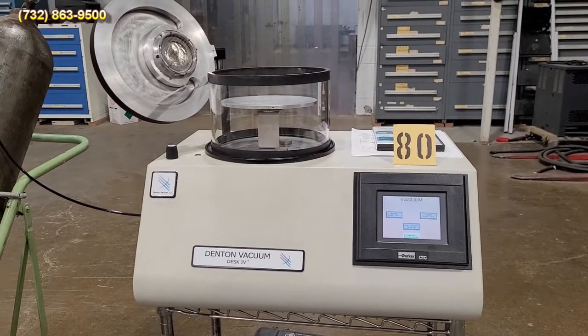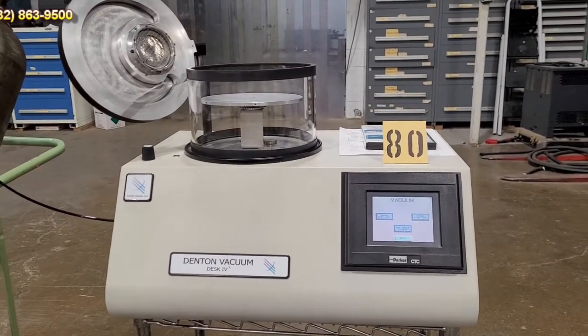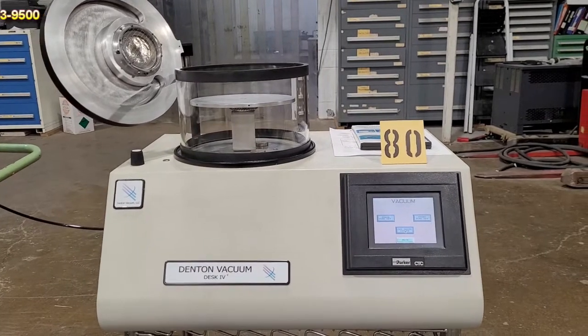The gas cylinder does not come with it. It's just everything you see right here in the picture, and that is the end of the test.